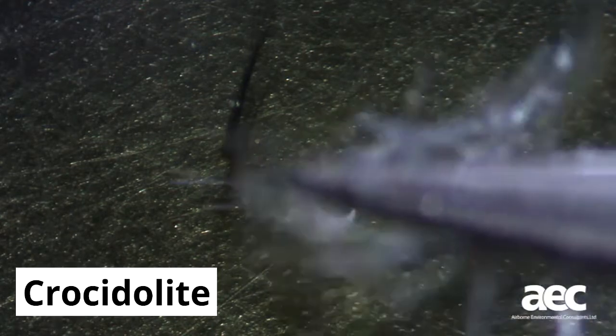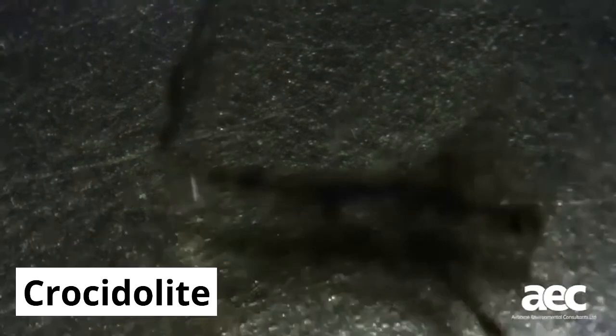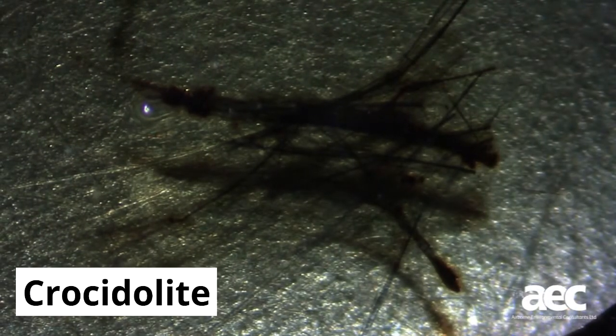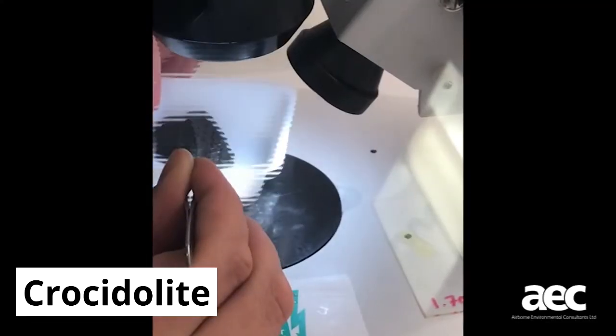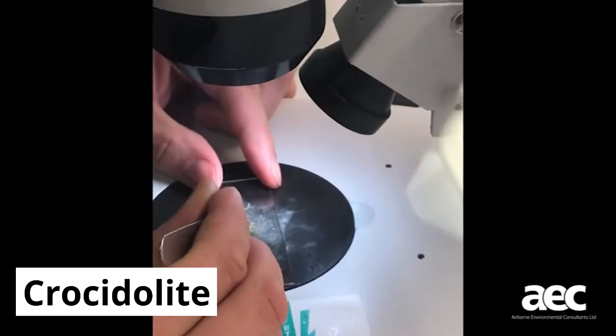The analyst places the prepared slide under the stereo binocular microscope and mounts multiple suspect fibres by lowering them into the liquid. After this, a cover slip is placed over the slide, and the slide can be brought out of the dust cabinet. The slide is placed under the polarised light microscope, and the process repeated.